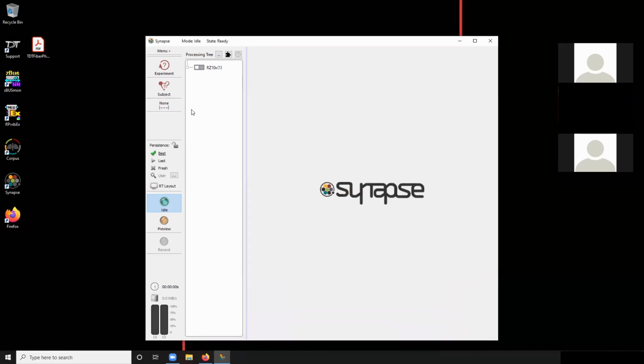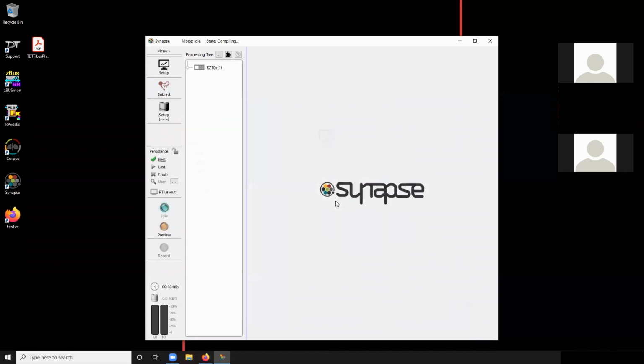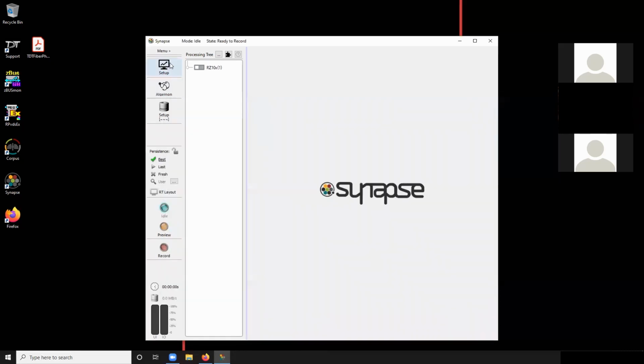Pretty straightforward. Now, in the Synapse menu, we have no experiment or subject setup. I guess this is a fresh computer entirely. So basically what we'll want to do is make a new experiment and a new subject, because right now we can't record anything because we don't have either of those defined. So if I click on the experiment name, I'll just say new, and we'll just call it setup. And now I'll make a new subject. All right, so now I have a subject and an experiment name, and now this record button is available to me. Now, why is that the case?